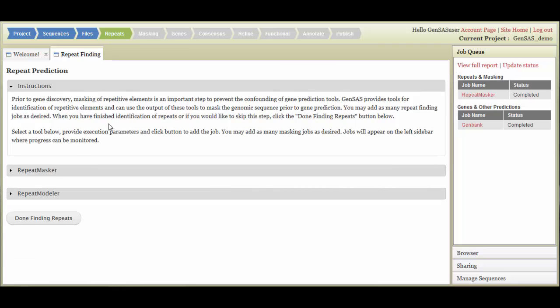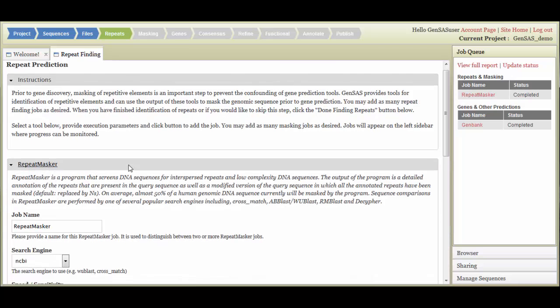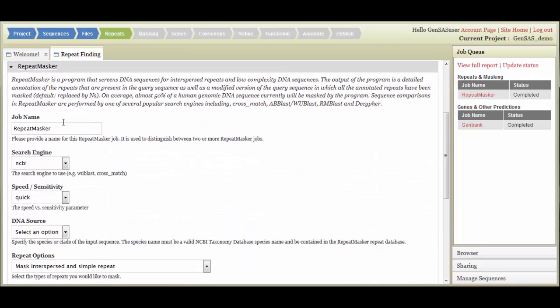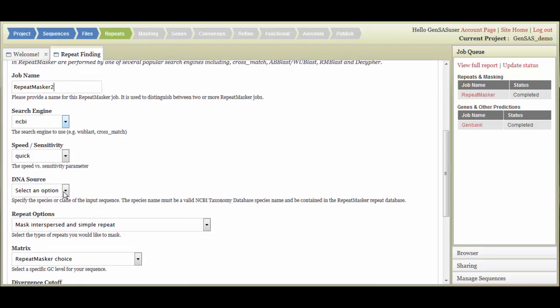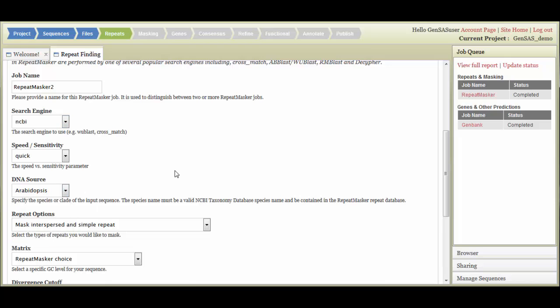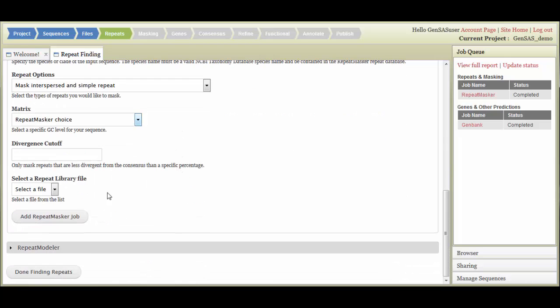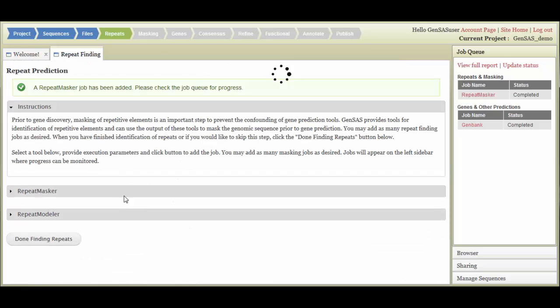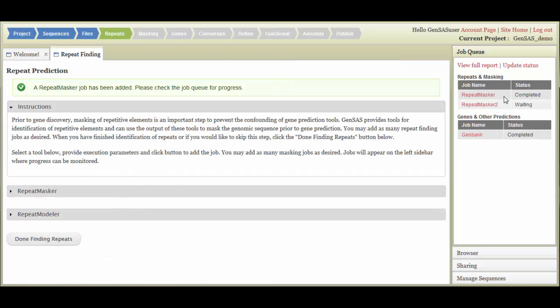If you would like to add another Repeat Masker job with different settings, all you have to do is change the name of the job and pick your settings, and hit Add Repeat Masker Job. The second Repeat Masker job will be added to the job queue. For all tools in GenSaaS, you can run multiple instances of each as long as the job name is different. Once you have set up all the repeat finding jobs you would like, click the Done Finding Repeats button.